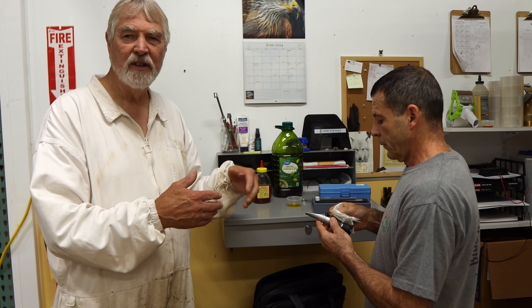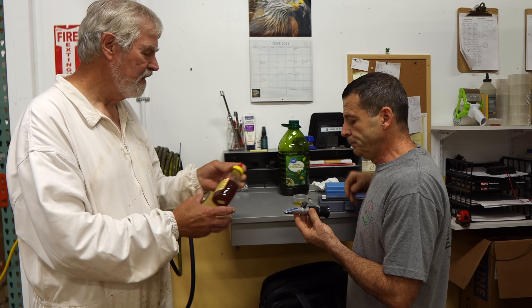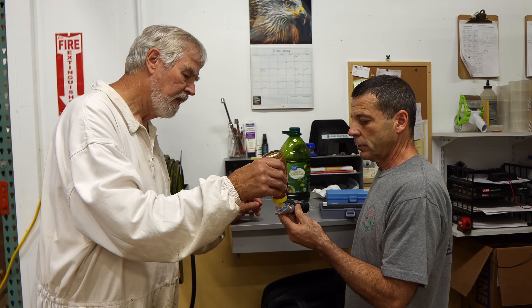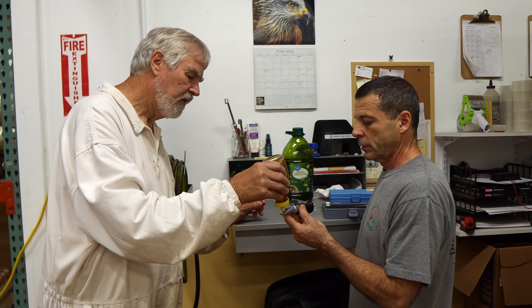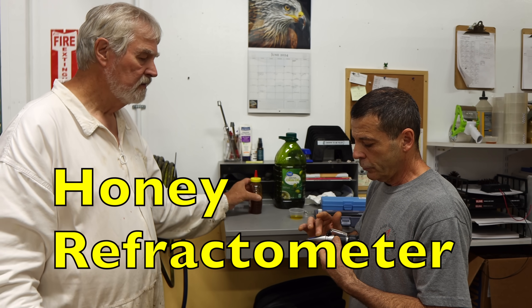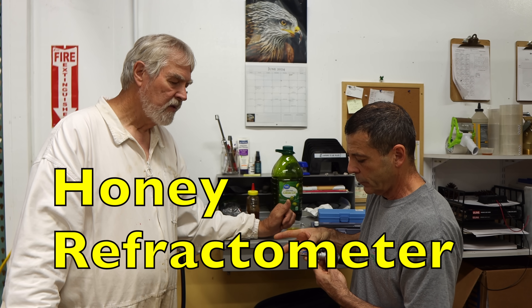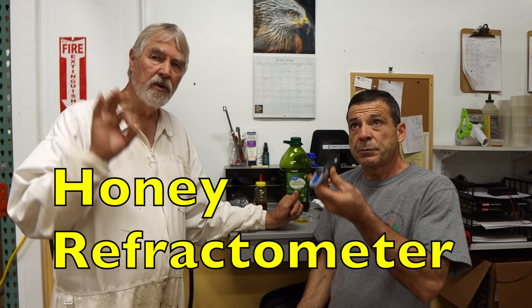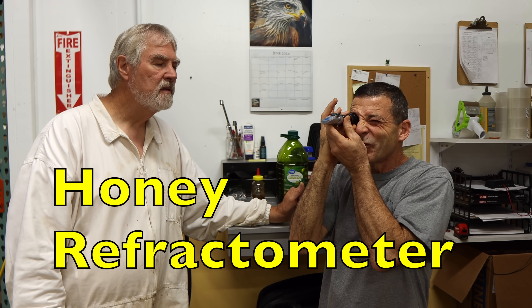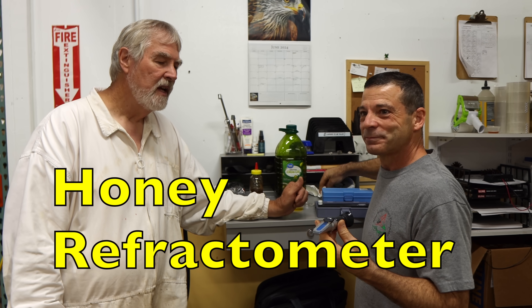Ideally you want to clean that — this is quick and easy. Usually we get it really clean before we test honey. This is our sourwood from last year. Just put it on real good, get all the air out of it. You just point it towards a light source and you get a really good reading. It reads at 16 — 16% moisture. I like 16. 16 is a good place to be.